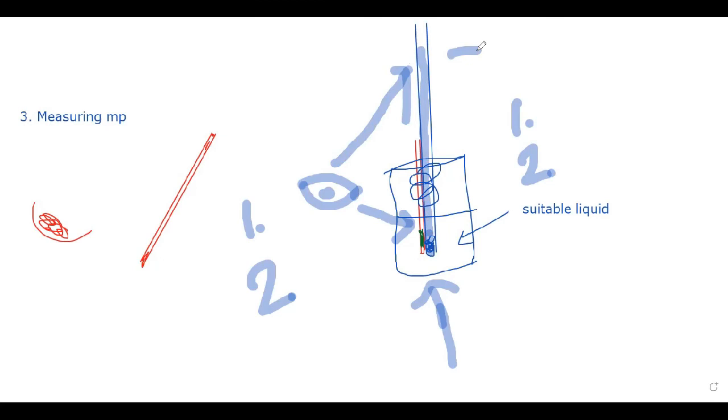If the sample is not pure, then two things will happen. One, the sample will take time to dissolve. It started dissolving but will take longer time to dissolve. If it is not pure, it takes a long time, understood? And if you repeat the experiment, you may get a different temperature at which it melts.